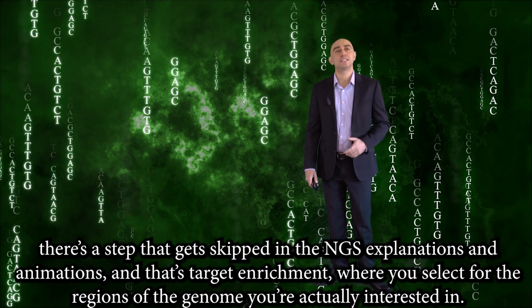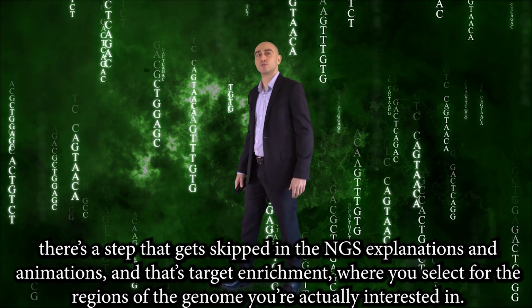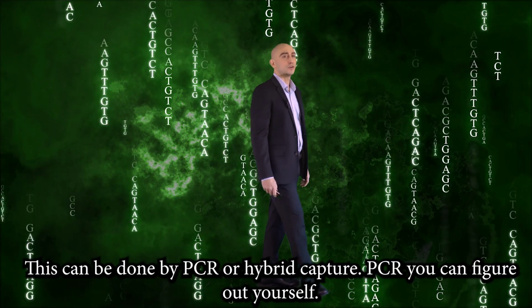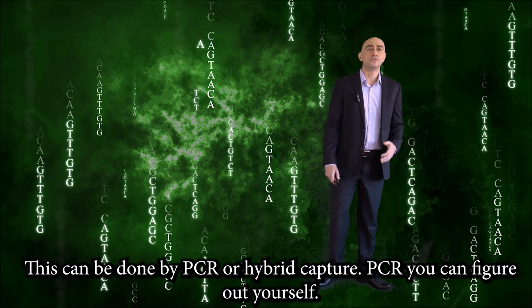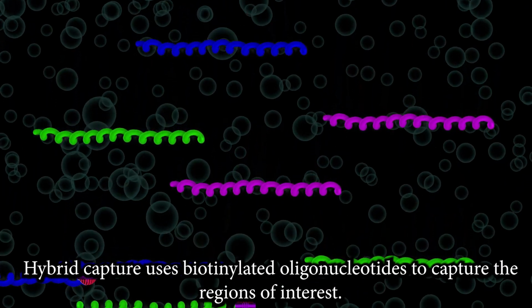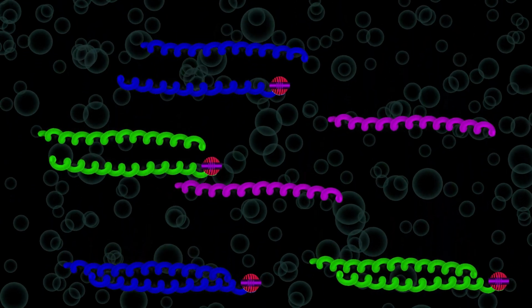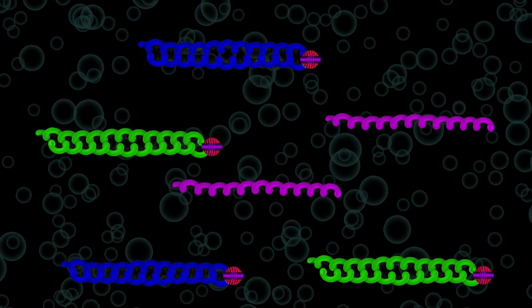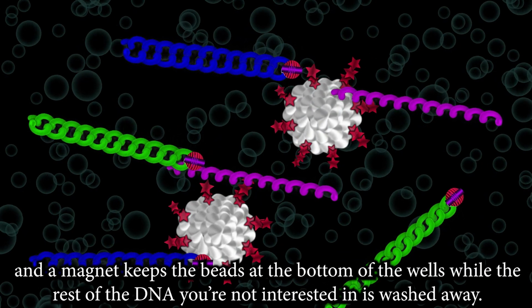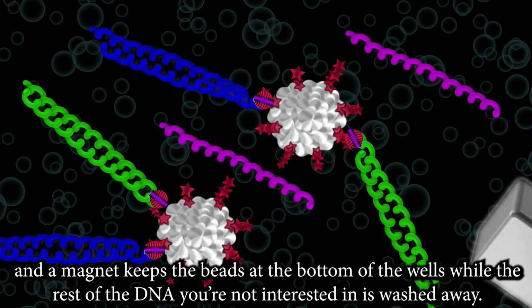Here's a step that usually gets skipped in the NGS explanations and animations, and that's target enrichment, where you select for the regions of the genome you're actually interested in. This can be done by PCR or hybrid capture. PCR you can figure out for yourself. Hybrid capture uses biotinylated oligonucleotides to capture the regions of interest. Magnetic streptavidin beads bind these complexes, and a magnet keeps the beads at the bottom of the wells while the rest of the DNA you're not interested in is washed away.